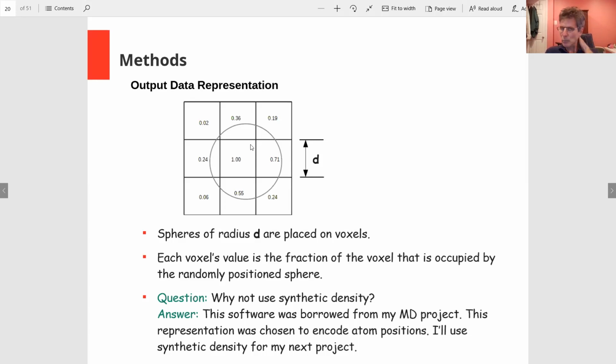So what you can do is take a weighted average of the pixel and its neighbors, weighted by these fractions, to get a more precise location for where the atom is located. And that works fairly well, because you're involving 20 or so pixels, you're getting something like an accuracy that's 20 times better than just using the pixel itself.